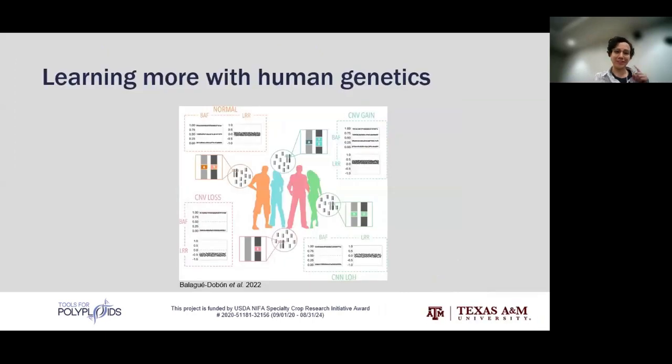But human genetics, they do more than this, and I want to go further. So far, we are able to detect at chromosome level, and humans do locus level. They do CNVs. But for that, they had another measurement.